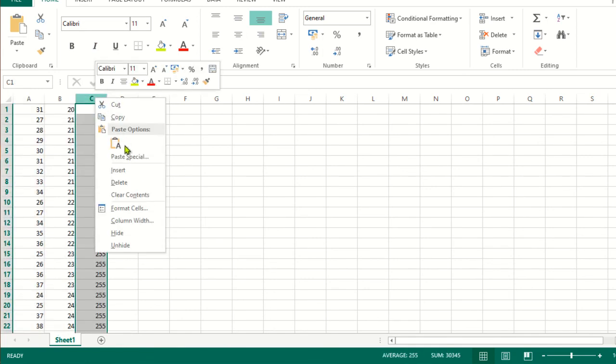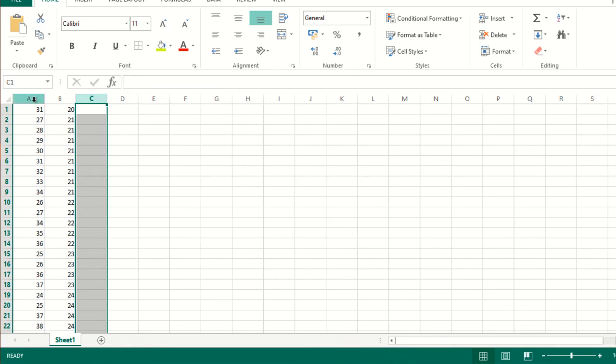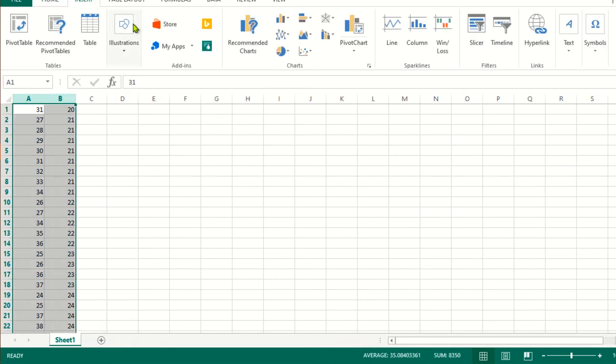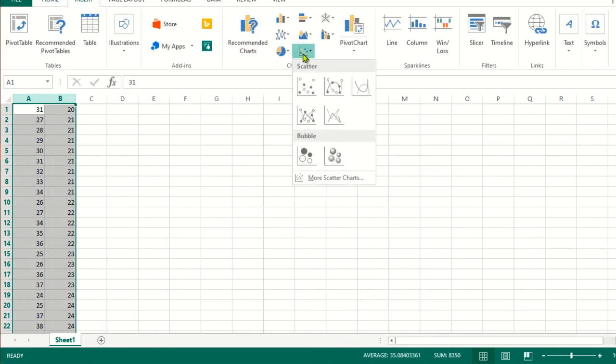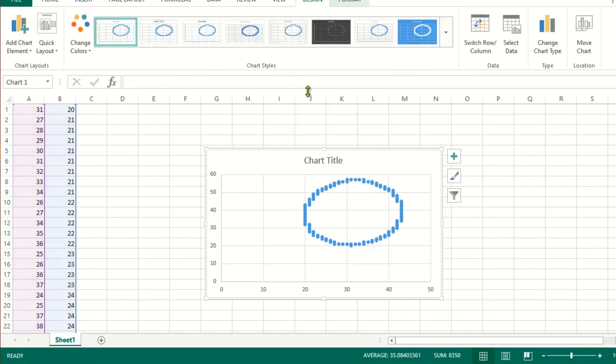Here is Excel. I will paste the data. I don't need this grayscale value, so I will delete this column. Simply select columns, go to insert, and go to scatter data. Just plot it.